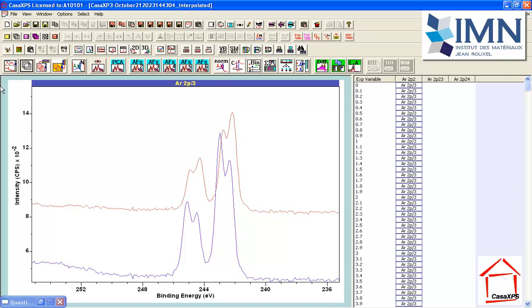And the reason that I think there are more than two peaks is because I see an offset here. And that offset suggests that I would be able to construct a peak model probably with 3 doublet peaks, and that would fit the data equally as well as the peak model that I've already constructed. But that wouldn't be enough to tell me that I should do that. This could be a mathematical artifact, so I need to look at the data and try and understand what I'm seeing. And this involves understanding how XPS works.